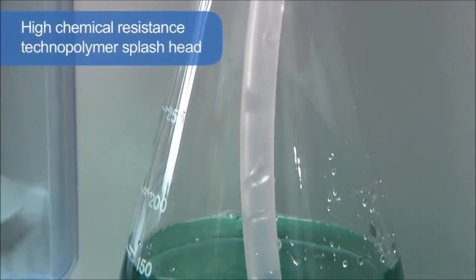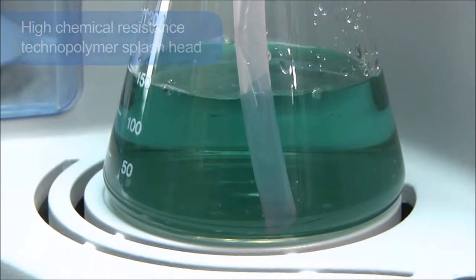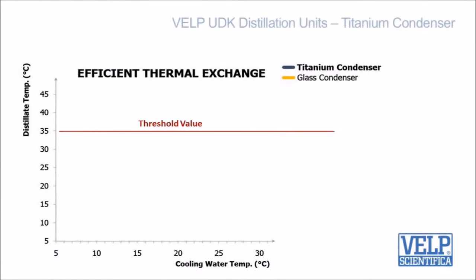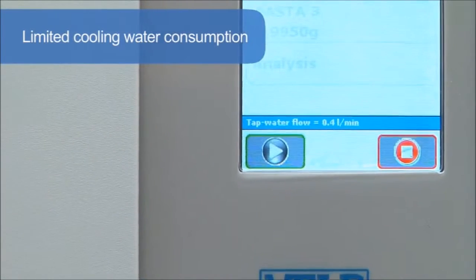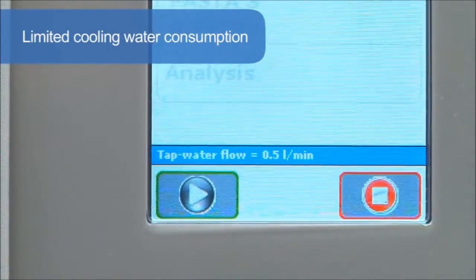The high-chemical resistance technopolymer splash head is the most resistant solution available. Another exclusive key component is the titanium condenser, one more patented solution. It guarantees that the distillate temperature always remains below the threshold value for total nitrogen recovery. In addition, the cooling water consumption is really low, starting from only 0.5 litres per minute.